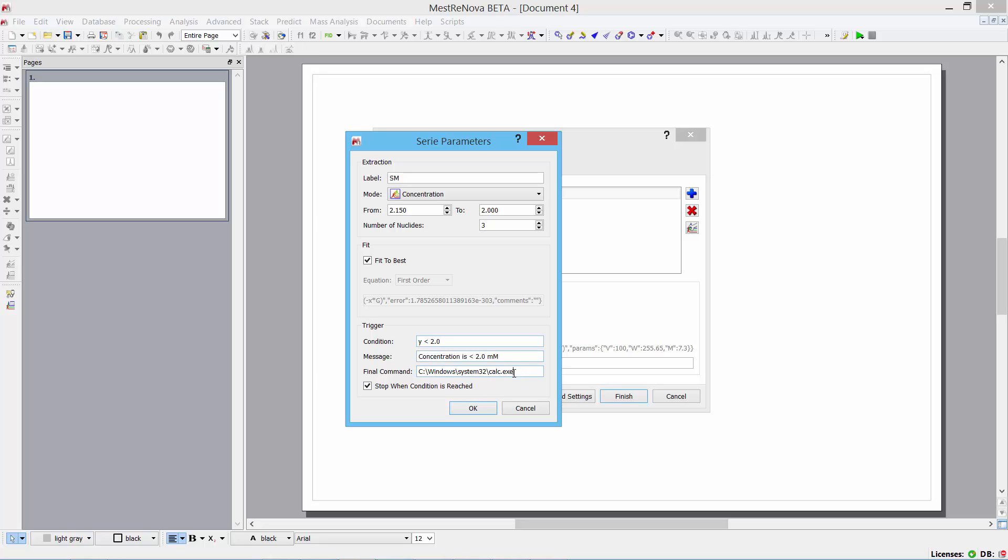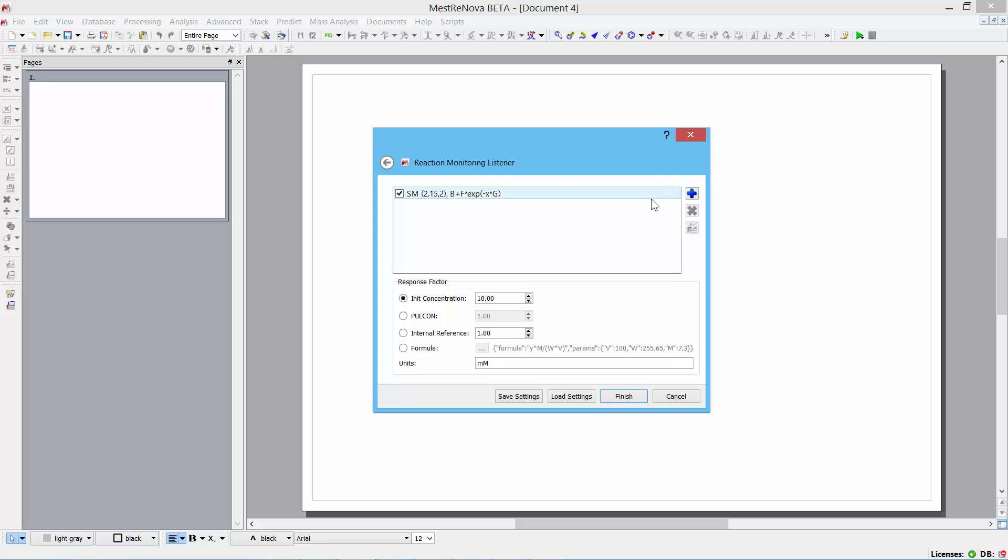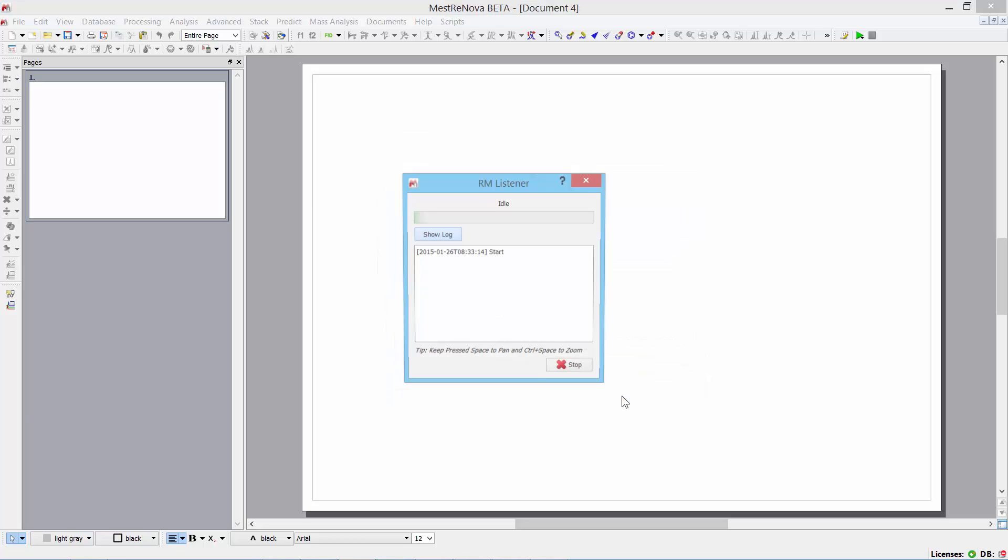And a command is applied to the window. In this case, I'm just firing up the calculator just to show you that it works. And I'm telling it that I want it to stop importing when that condition is reached. And you can have several of these, multiples of these, as you see fit, as you'd like to monitor. So, when I've got this set up, all I do is click finish.